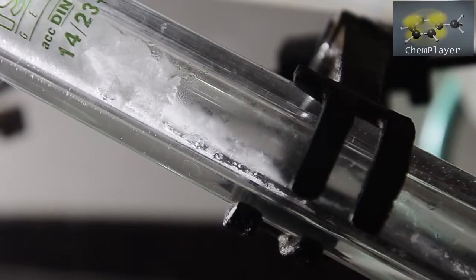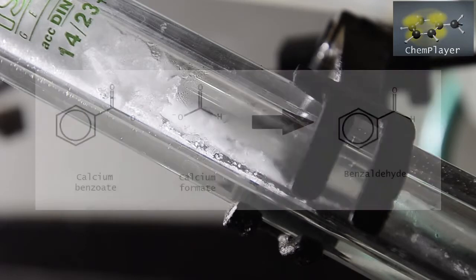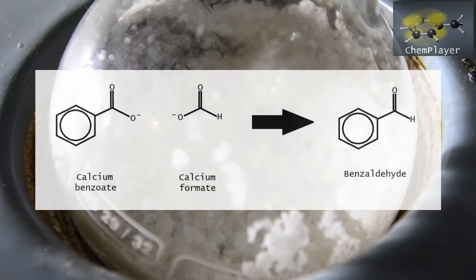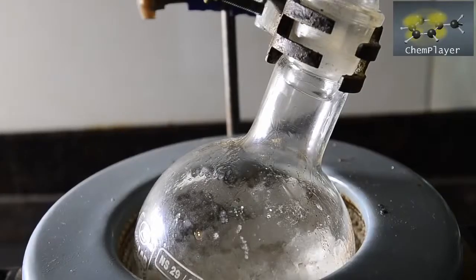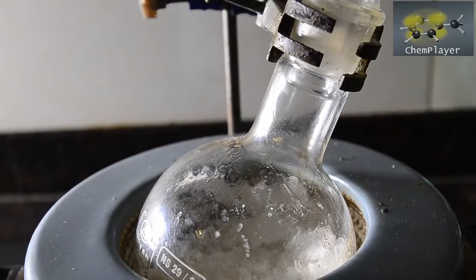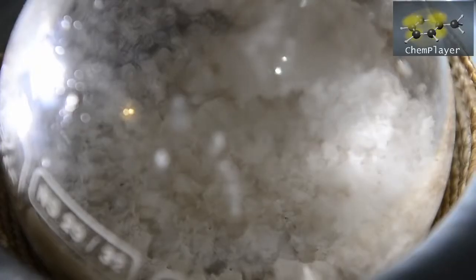This looks like benzoic acid. If our reaction works, then our ketone produced is going to actually be an aldehyde, benzaldehyde. As you can see from this reaction schema, we continue heating the mixture very strongly, and we can see puffs of white smoke appearing in the flask.